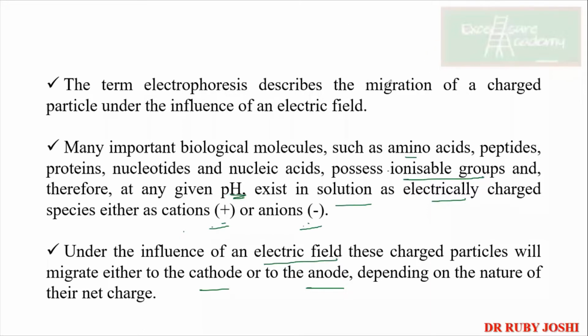Ma'am, anode is positive. Yes, correct. So anode is positive, so your DNA is going to move from cathode to anode. Okay, this one is negative. Cathode is negative charge. Good. So depending on the nature of the net charge, the molecules will move.